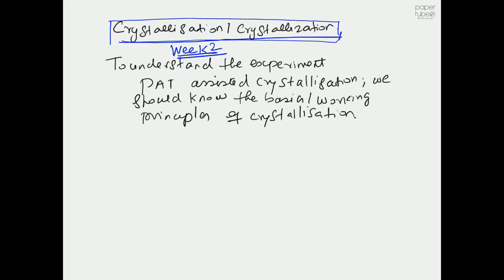It's not easy to go to the lab, mix some things, and take the crystals out. That's no way when you are dealing with a crystallization experiment. Everything should be extremely clean, like any biological process. You should pay the same level of attention to detail, in terms of cleaning and drying the reactor. It should be free of any impurities or even dust particles, because all of those things will affect the experimental outcome of any crystallization experiment, not only the one which I already posted on YouTube for you.